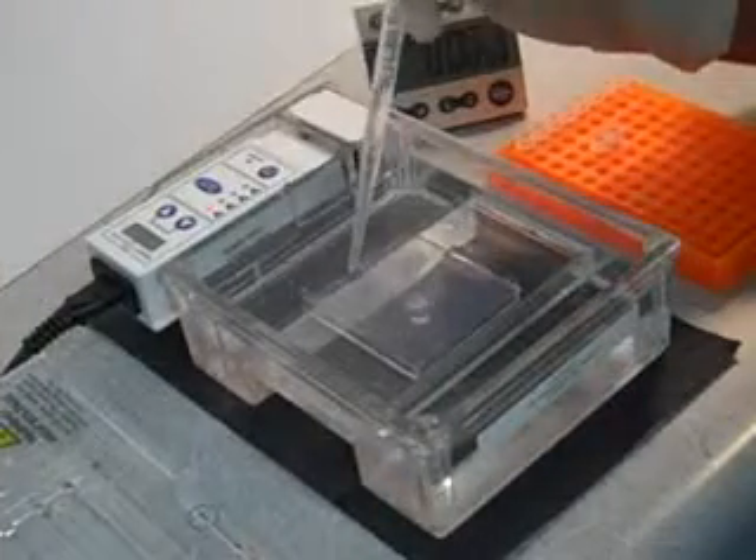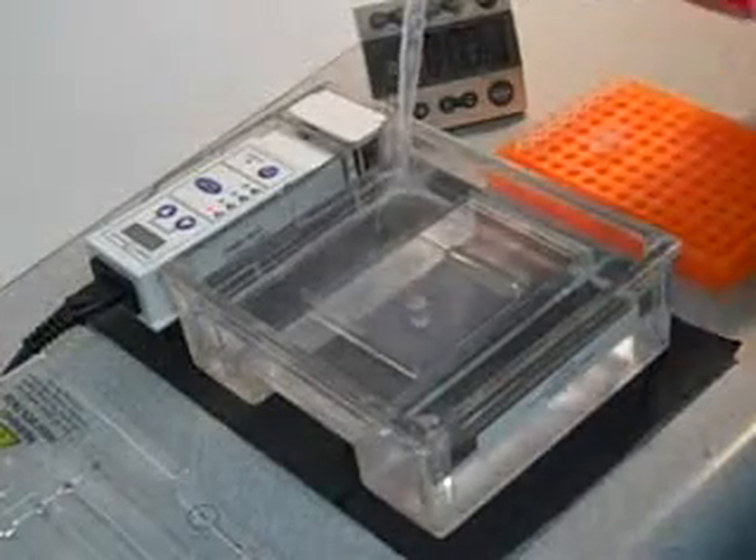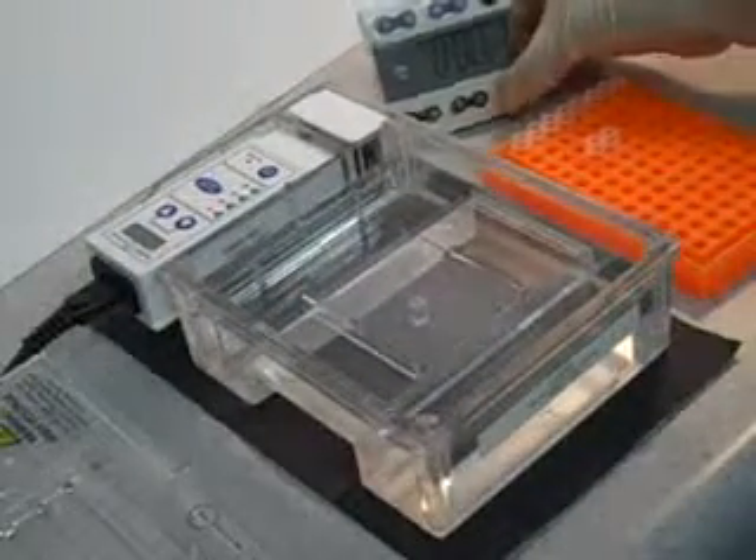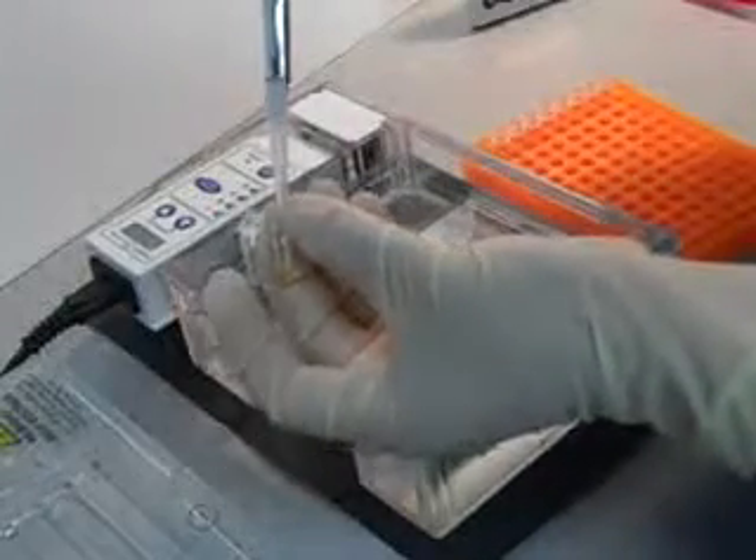While we are still waiting, wash out the wells with some running buffer. Time is up! Mix it a little more, then load it into the wells.